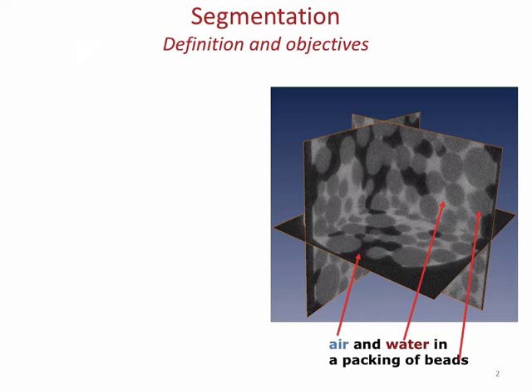And if there is surface roughness that is below my resolution, I will not see it. Okay? So I almost have some sort of fractal behavior of a surface, whereas in the BET method, it's the gas molecules that go in there and figure out where the surfaces are and how to attach. So I have a different level of resolution. So with comparison, you should be very careful.